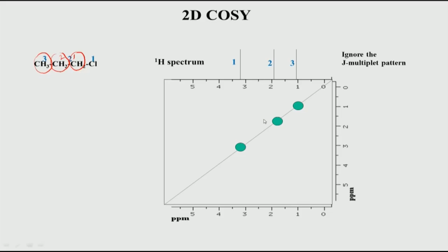That means part of the magnetization is retained on its own. If I have spin A and B, or 1 and 2 in this case, proton 1 will not transfer all its magnetization to 2, it will keep a lot of it on itself, typically 80%. So, only 10 to 20% will go to the other side.